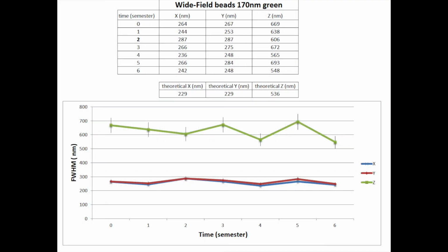What have we learned today? We have learned how to track optical microscope performance over time. Now, we advise you to keep the data. Create a table of the measured value with the date of the acquisition in order to track the microscope performance in time.